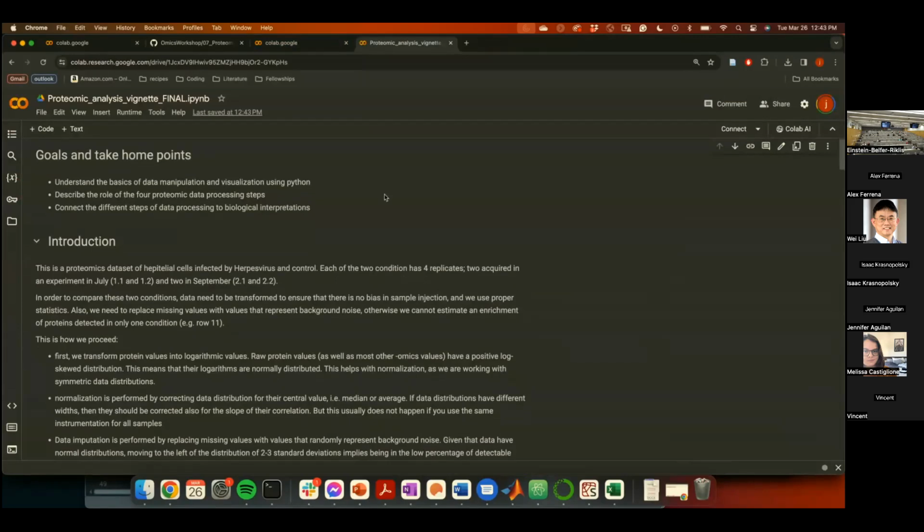How Google Colab works is that it gives you a remote computer from who knows where that has all the specs that you need. It has Python installed and all the packages that Python requires for this vignette already installed. So you don't need anything on your computer except to follow along. I'm going to give you a couple minutes to load in the notebook.